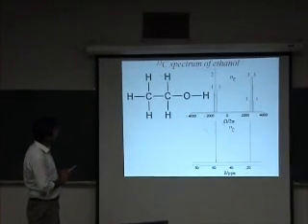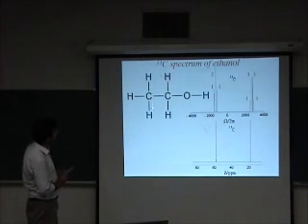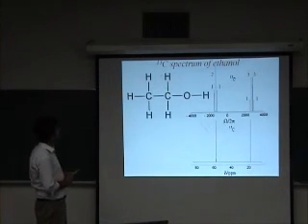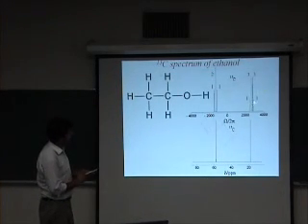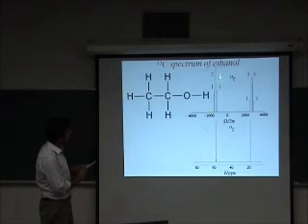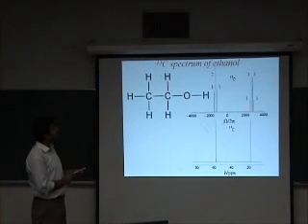Of course, one of these groups of peaks or one of these multiplets comes from the methylene proton and the other multiplet comes from the methyl proton. And this is the peak that originates from the methyl carbon-13, and this is the group of peaks that originate from the methylene carbon-13. Now, how do we explain the fine structure of the multiplet?